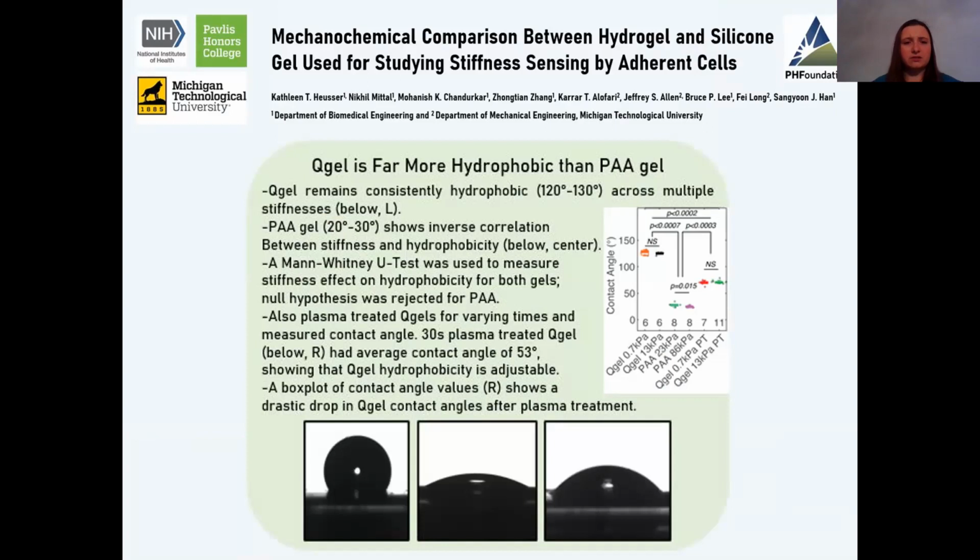We used a Mann-Whitney U-test to establish that more stiff polyacrylamide gel definitely leads to a more hydrophilic gel, or a lower contact angle. Also, we plasma treated Qgels for varying times from 30 seconds to 2 minutes and found that 30 seconds was most successful in lowering the contact angle, or making Qgels less hydrophobic. This showed that Qgel hydrophobicity is adjustable.